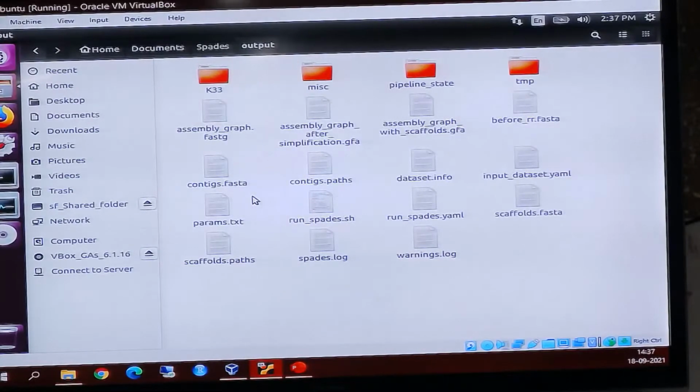They started with raw reads, but they didn't mention which platform they used. You can inquire very well. They will tell you, nothing to hide.